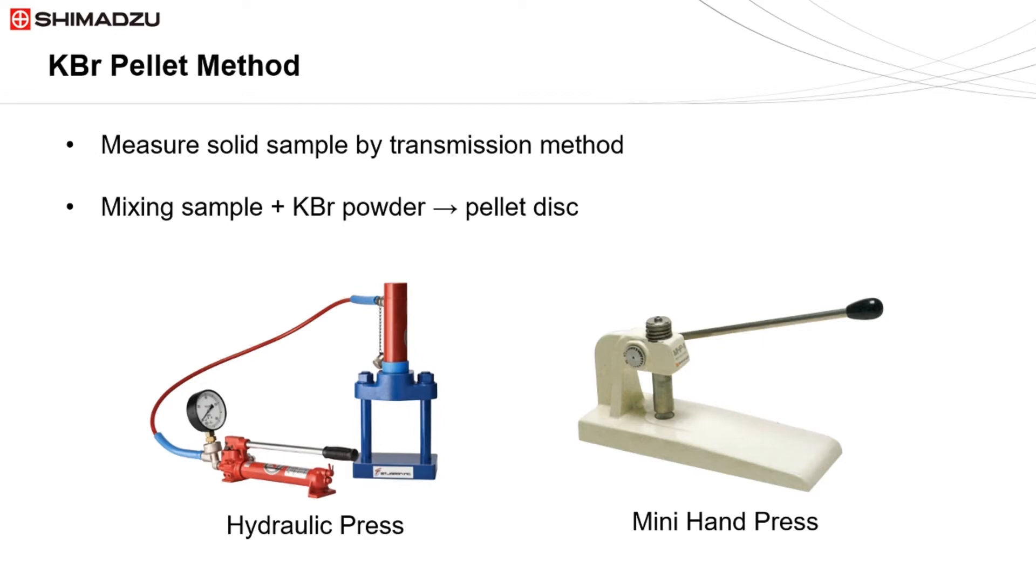I am going to show you how to make KBr pellets using the MHP-1 accessory.